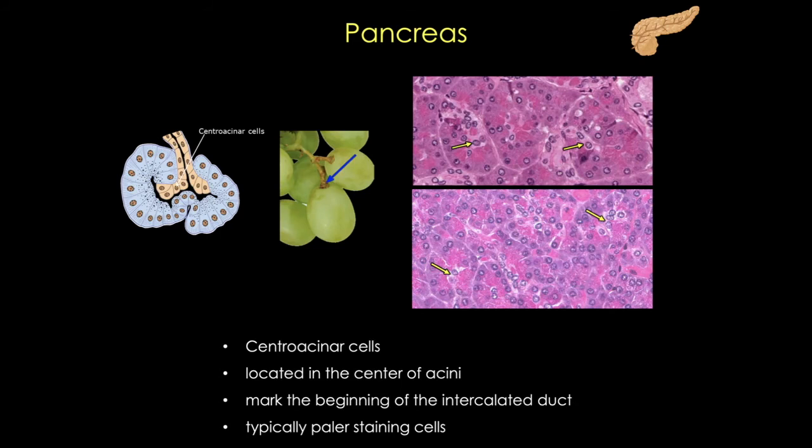But what happens when you're looking at a section of the pancreas and you don't see any islets and you really have trouble identifying central acinar cells? Well, that's exactly when folks do mistake this gland for the parotid gland. So now let's go ahead and check out a couple of features that are unique to the parotid gland.